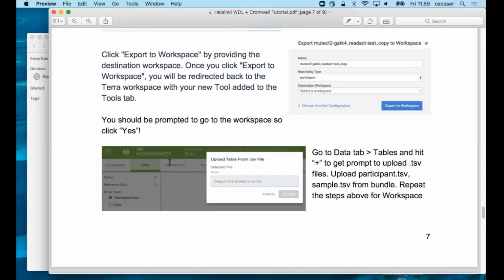And then you hit save. So now you have all of these values, and these are your main input files and so on and so forth, right? If you wanted to upload a data set, how would you do that? Remember we have this data column with all this information.